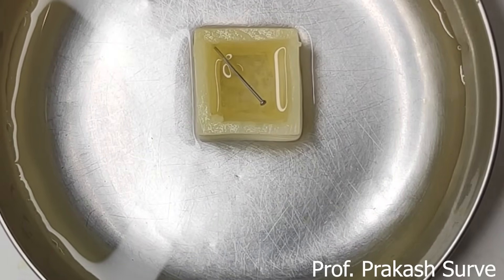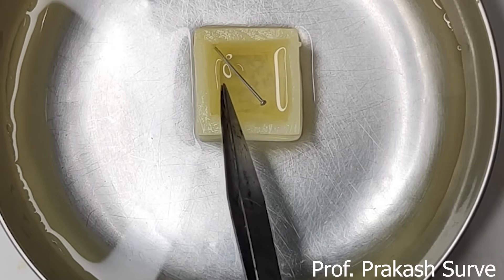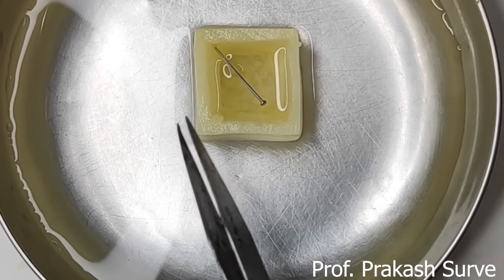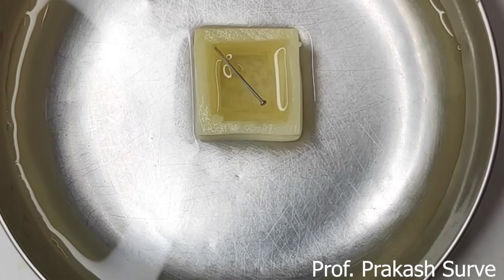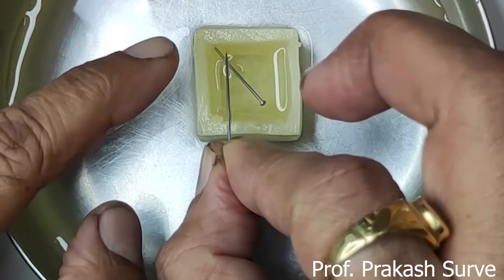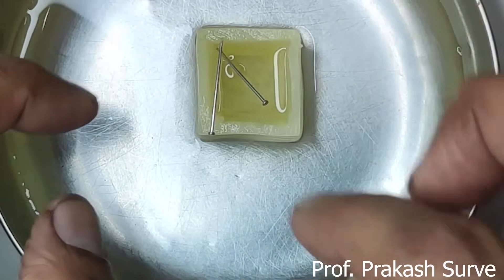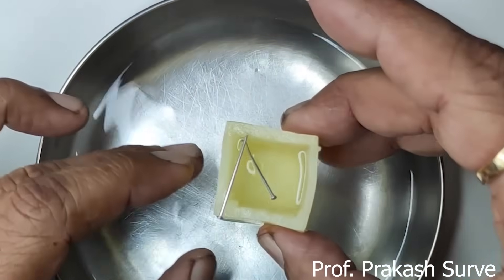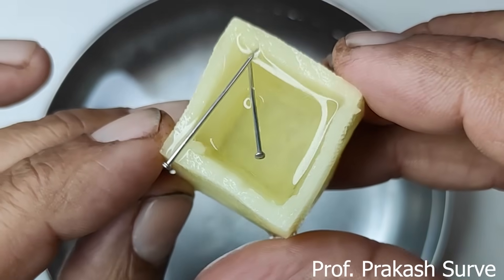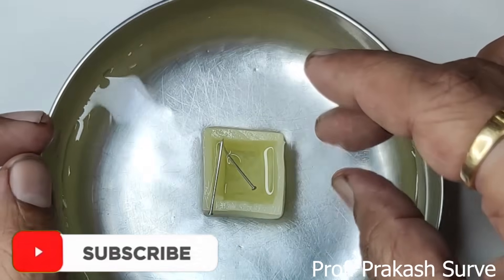After one hour, we got the result. The level of the inner salt solution has risen up because water has travelled from outside to inside — this is called endosmosis. You can check the level: here is the initial level marked by the pin, and now the water has risen up to here. You can see the difference between both levels. It has risen up to the top, demonstrating endosmosis.